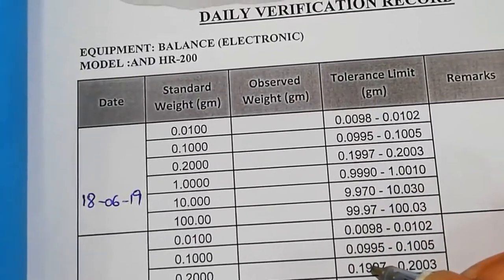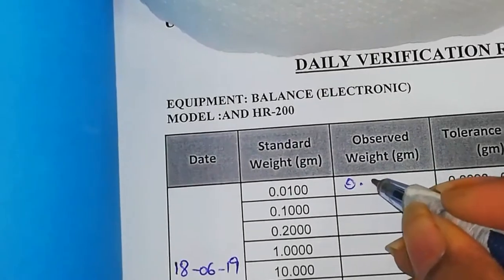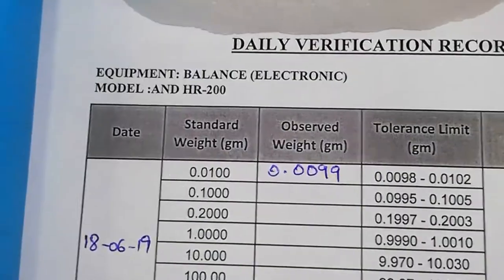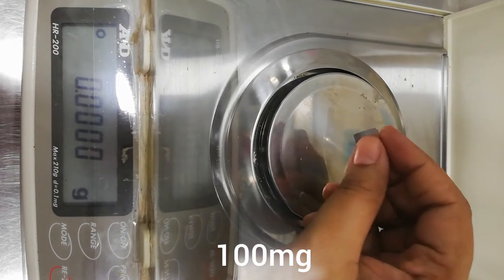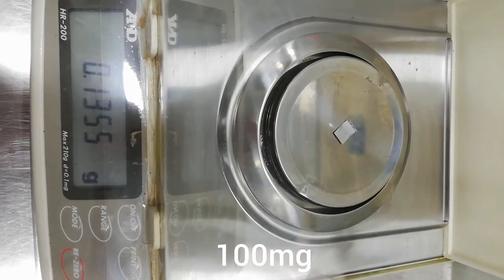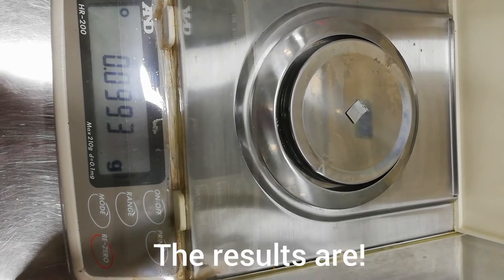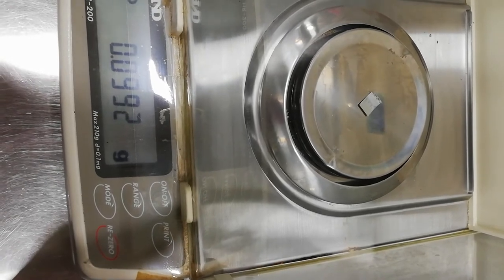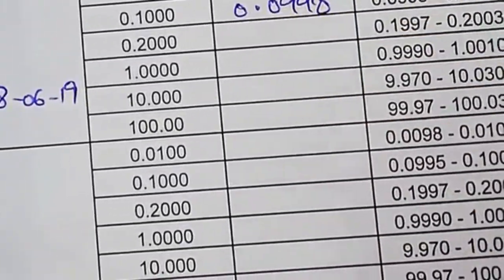The sheet is used to write down the observations and results, which must be within limits. If I get a result of 10 milligrams, I will write it down like this. Let me show you 400 milligrams and the others. I tare first, put the weight on the weighing scale, and wait a few seconds until I get the result, then write down the results on the sheet and compare with the limits.